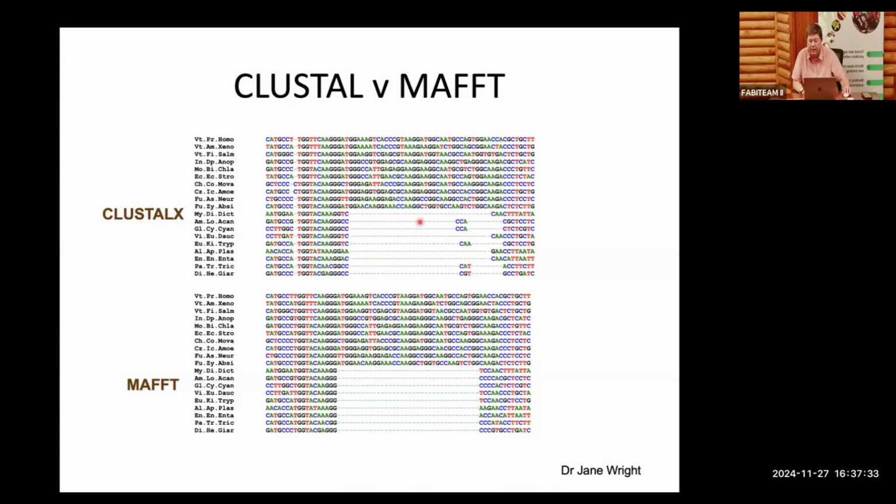So here we will have an indel, then an insertion, and an indel, an insert, and excuse me, I want to correct myself. So we will have a deletion, an insertion for that sequence, a deletion. Whereas here we just have basically one evolution step, and that was the complete deletion of that region. You can then, of course, go back and check whether it's codons, and what was excluded doesn't make sense. That is just the downstream analysis to ensure that your sequences are optimally aligned and make biological sense.